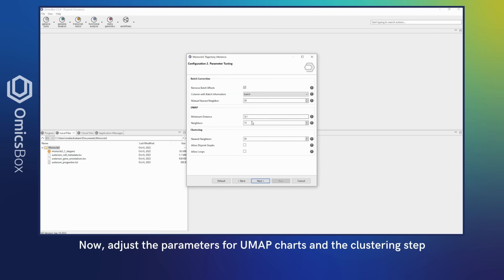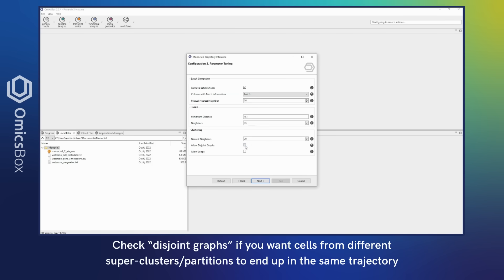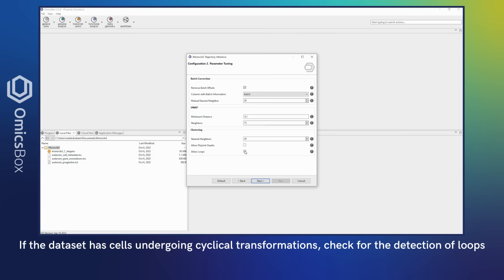Adjust the parameters for UMAP charts and the clustering step. Check disjoint graphs if you want cells from different superclusters or partitions to end up in the same trajectory.